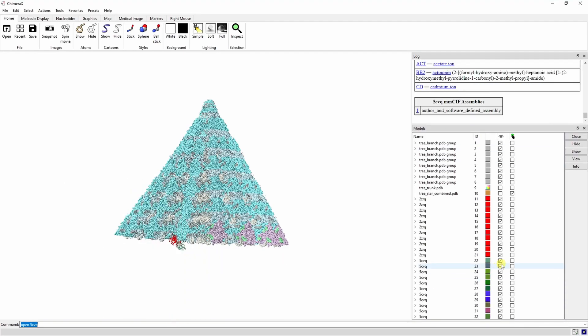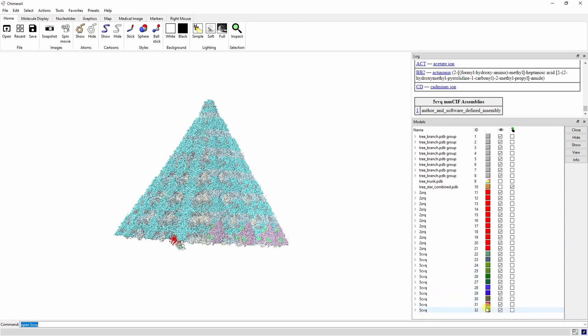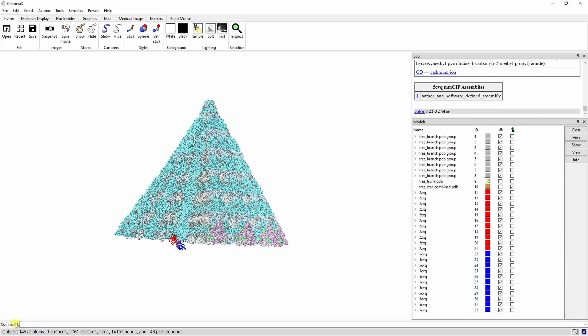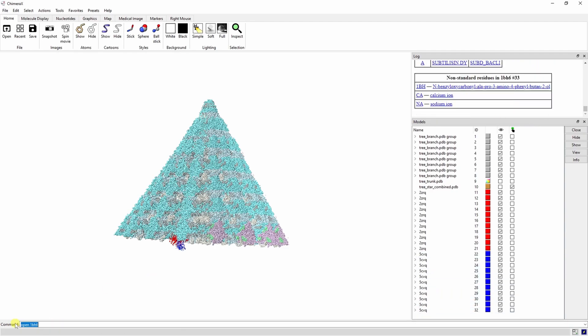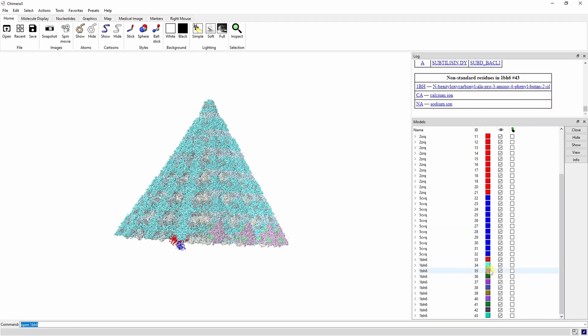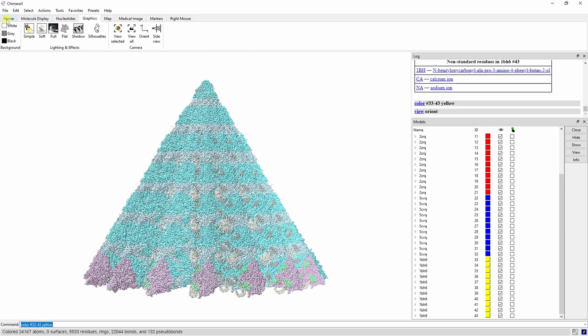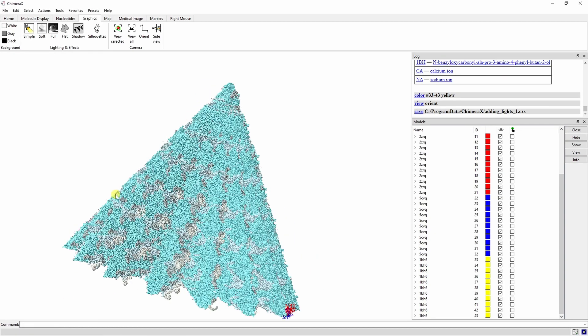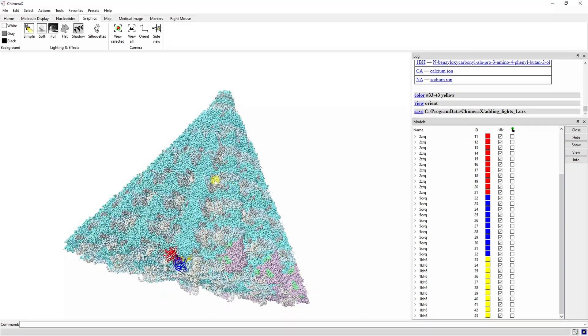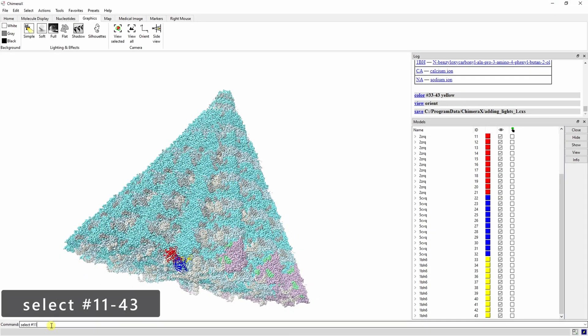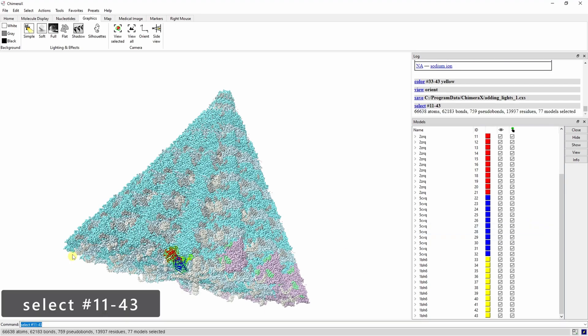2ZRQs and 1BH6s are subtilisin proteases. 5CVQs is a peptide deformylase. Showing the surface of these proteins will make it a little bit easier to see, but you'll have to recolor them after.